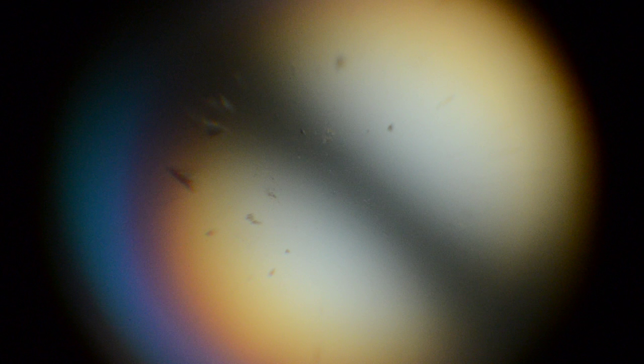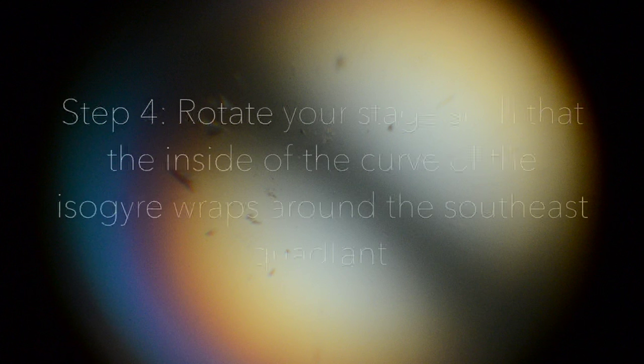The interference color bands circling the isogyre are called isochromes. The center, or elbow, of the isogyre is where there is an optic axis. This is called a melatope. Since we have two isogyres, we have two optic axes. This is where we get the term biaxial mineral. This is known as the optic axis centered biaxial interference figure.